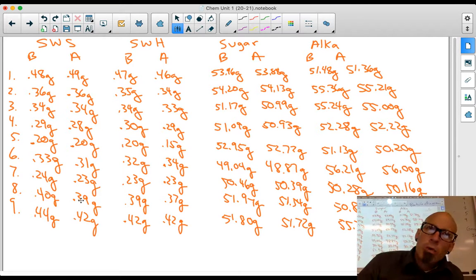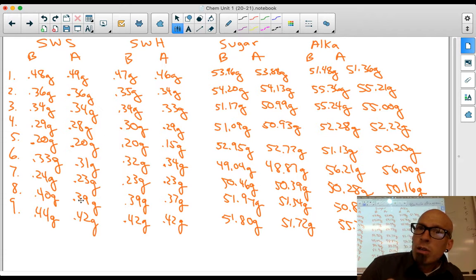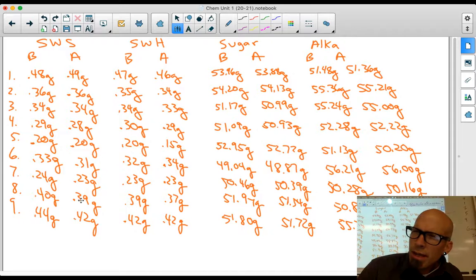So we think that 100th being off by 100th, maybe it didn't really change, and the scale is not sensitive enough to give you a consistent value every time. And so maybe we'll just say that 100th is the same. But if it changes by 200ths, maybe that's significant enough that the mass is different. Hopefully that makes sense.